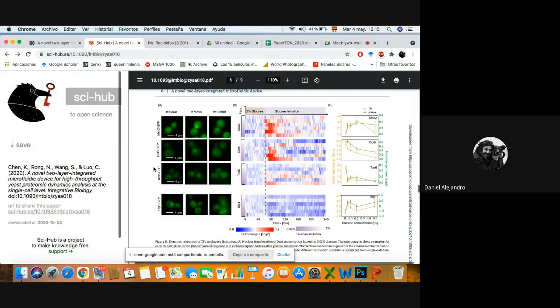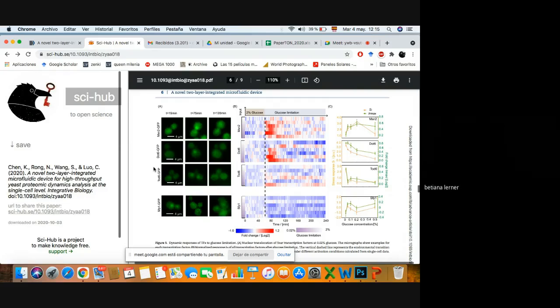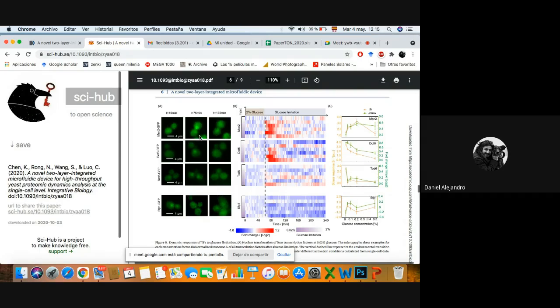Then they didn't collect anything. But from picture B, from where did they take the sample to measure the gene expression? The gene expression is the fluorescence. When you have a fluorescence and a mobile, okay. They use software for yeast, exclusive software for yeast.